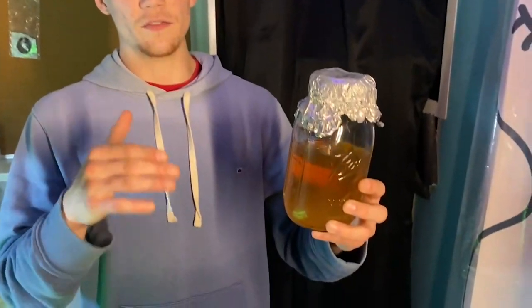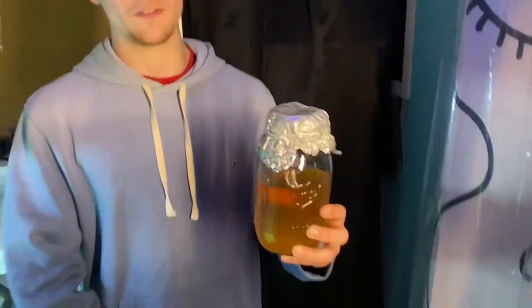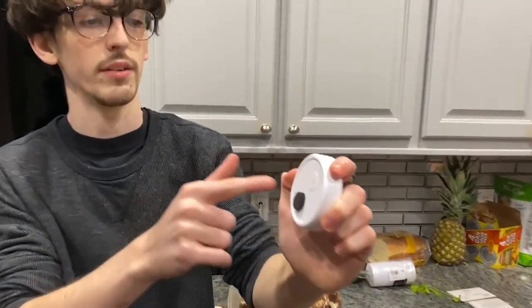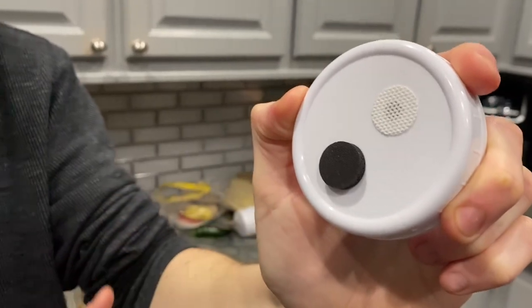If you're going to get started in mycology, I highly recommend you make this investment — get a pressure cooker and start making these to save yourself time and money. First, we're going to be sterilizing our jars and modified lids in the pressure cooker at 15 psi for 30 minutes. We recommend these modified jar lids because they have a ventilation port and an inoculation port.